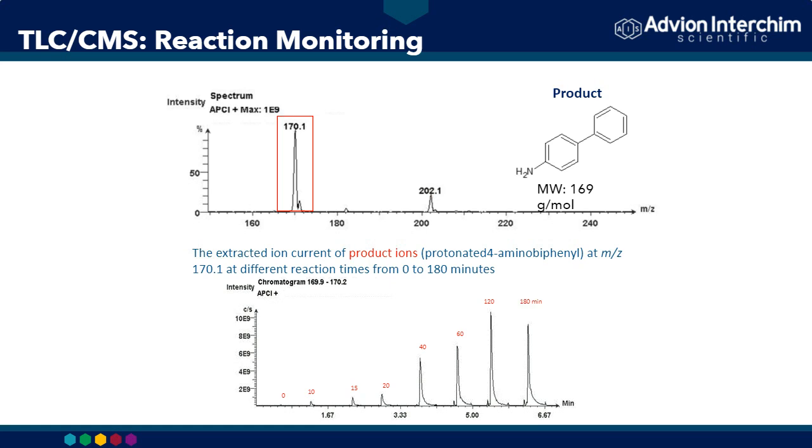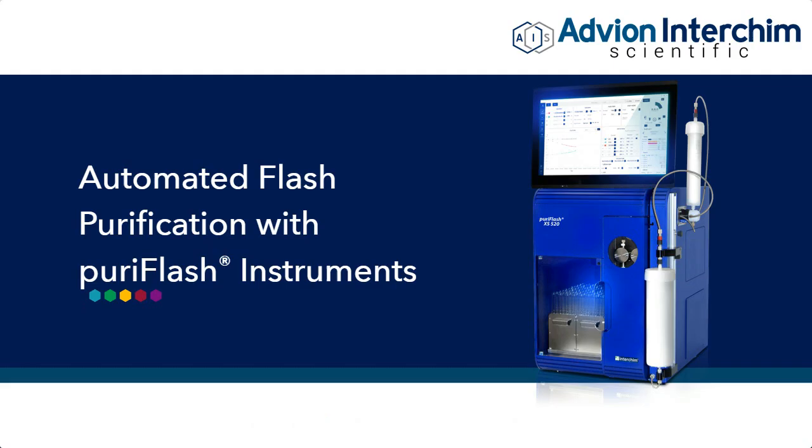Okay, so now that we've made our product, we were able to monitor it with the Plate Express. Now we need to work up the reaction and then purify. Okay, and this is where our friend the XS520 comes in. So this is an automated flash purification instrument.